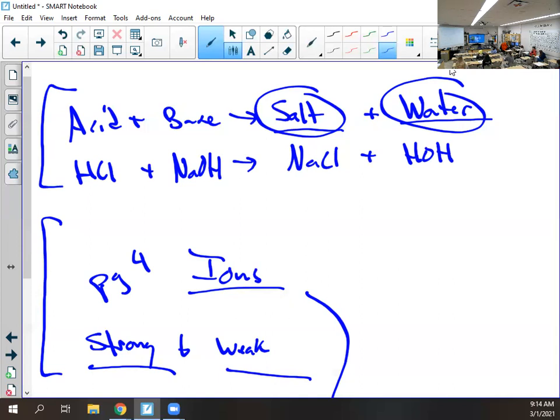So it was orange, and you don't have to put orange because it's always orange no matter what. So it says color change, you would write blue. Is that blue? All right. So you would just write blue. Then the row under it where it says pH number, you compare it to this.